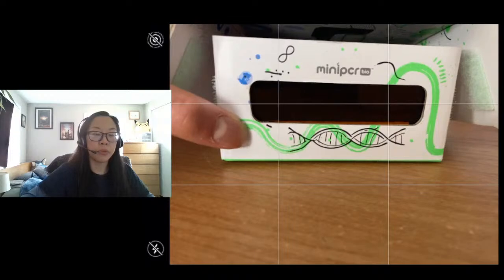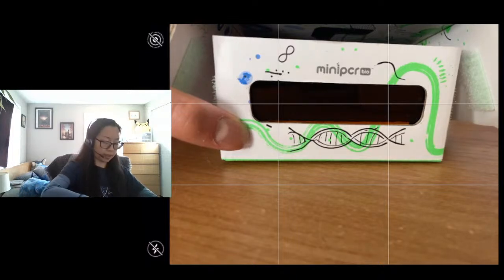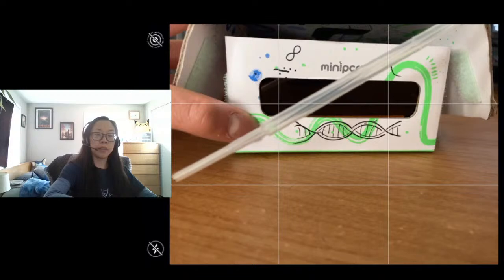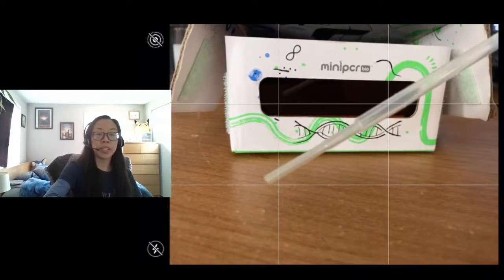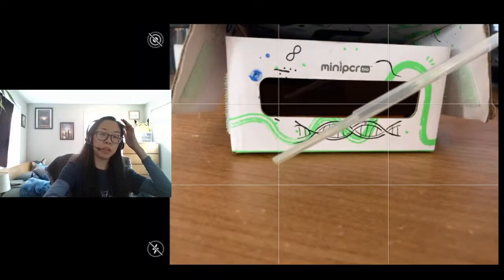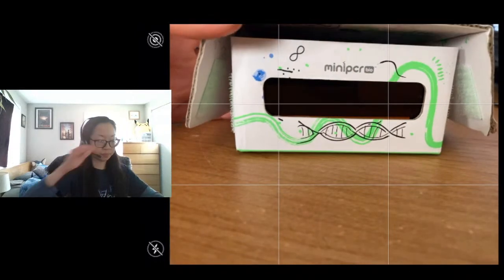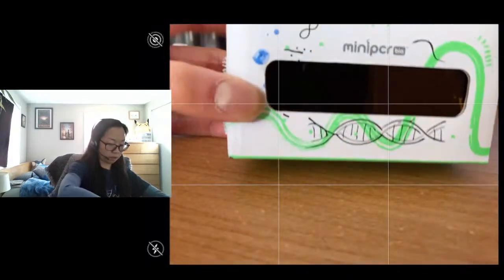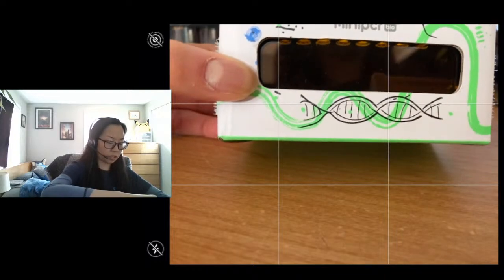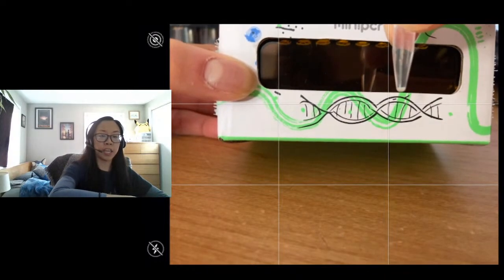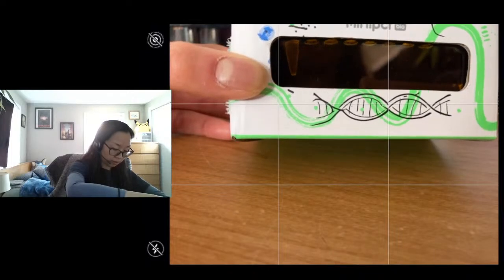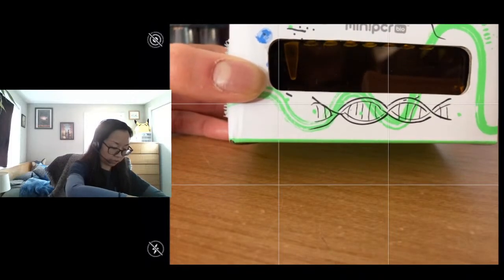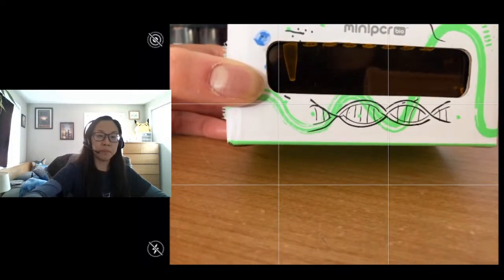I've already gone through my kitchen and taken some samples of various substances. You can just use a transfer pipette to take a little bit of each substance and put it in the little tubes provided. Then all you have to do is look at them in the p51. As a first tube, I have just water as a negative control, so we know what a non-fluorescent tube looks like and have a baseline to compare to. When I pop that in, we don't really see anything glowing, which makes sense because there's really nothing in that tube except water.